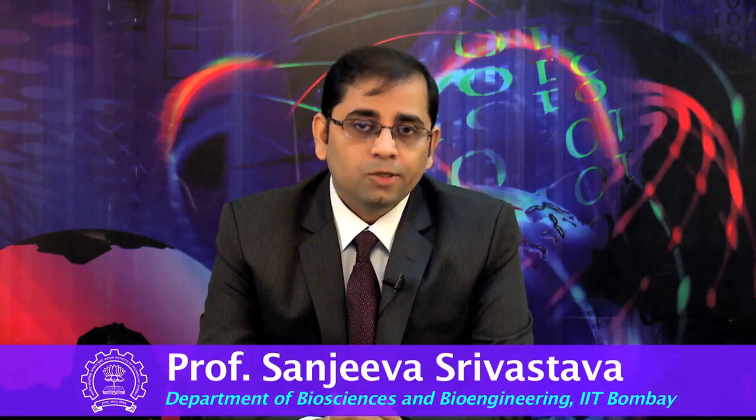Our eventual goal of this course is to introduce you to the concepts of proteogenomics, but we would like to develop the concepts of genomics first, proteomics, and then try to integrate both genomics and proteomics. So, in this module, we are going to talk to you about proteomic technologies, some basics, more advancement in the areas of mass spectrometry, and how one could analyze the data using various latest tools available.